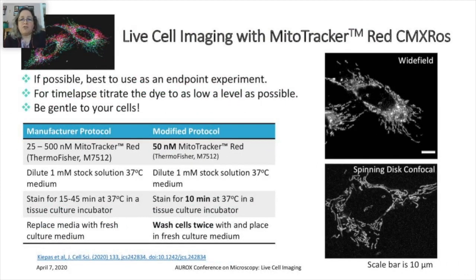So another caution when using any of these type of dyes in live cell imaging, again, the MitoTracker is kind of a nice endpoint assay, so you can just make sure that the system that you've looked at, your conditions, are good. If you do want to follow it throughout, what we do is we'll just image it, maybe every 10 minutes just to make sure everything still looks good, rather than trying to image it every time we take a time-lapse image. And then we carefully modify protocols as well.